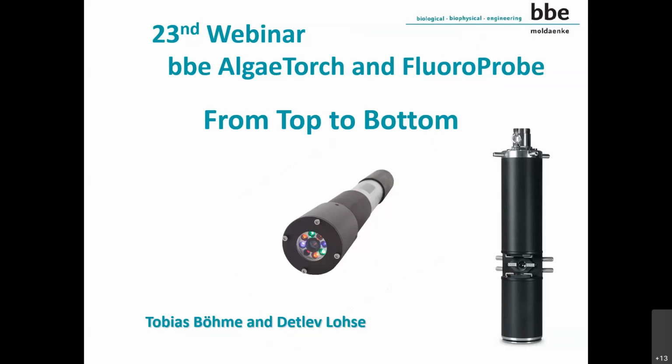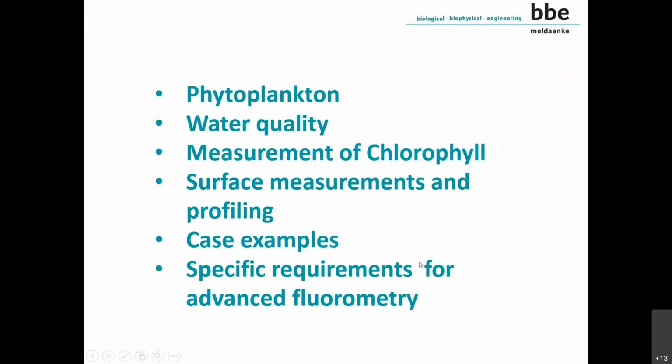My topics, I just have a list. I will talk a little bit about phytoplankton, what it is, and how it is related, for example, to water quality. With water quality, I mean not only the different parameters that we usually measure, but especially the measurement of chlorophyll, which is a main feature of phytoplankton.